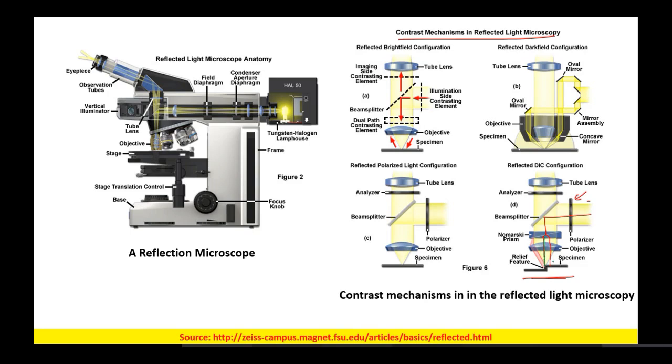They will move up over here, and again they will be recombined using this Normarski prism. So over here the same Normarski prism is decomposing the light, and at the same time it is again reconstituting the light. Okay, it is again merging the differently polarized light.